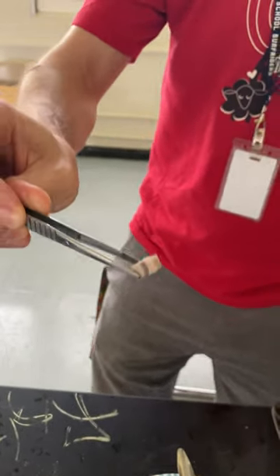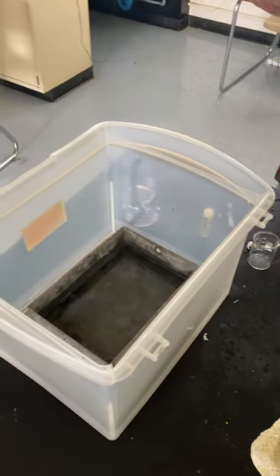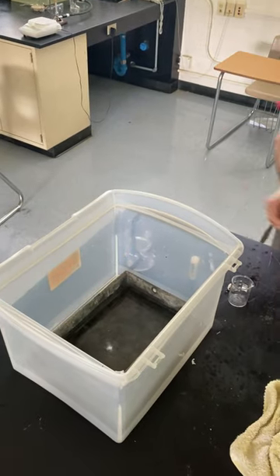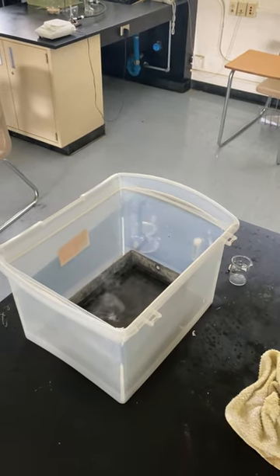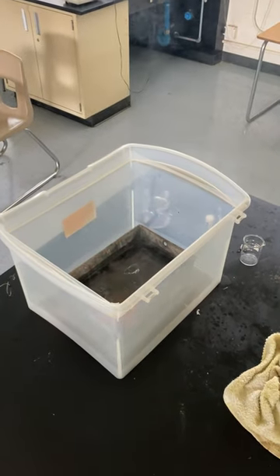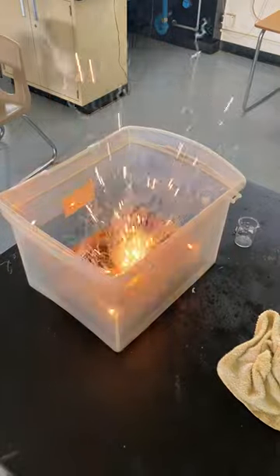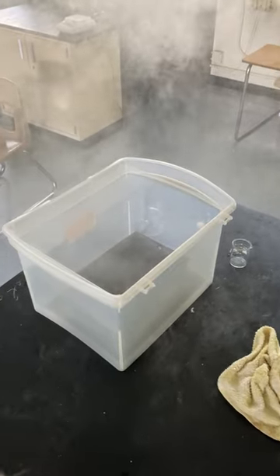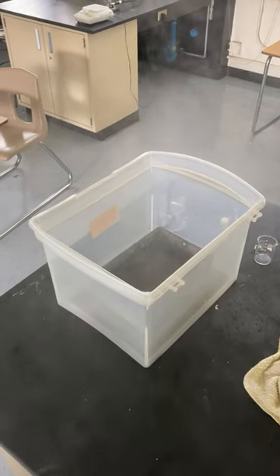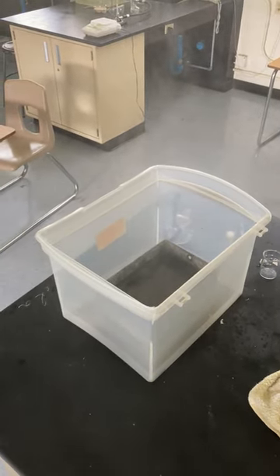But yeah, so let's stand back here, because... oh, sometimes this gets very good. There it goes. Jesus. Great. Science.